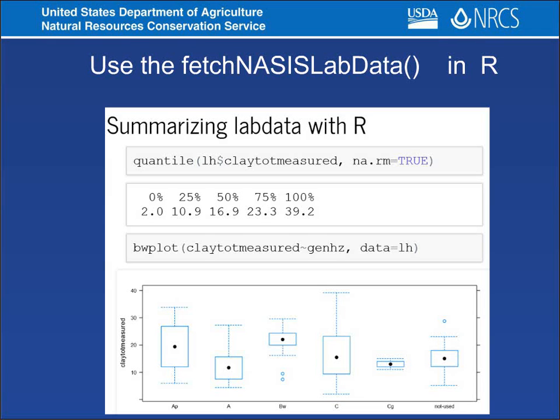And Dylan and his group, they've been working with R, and they've got a fetchNASIS query that you can use to extract the laboratory data and analyze it in R as well.